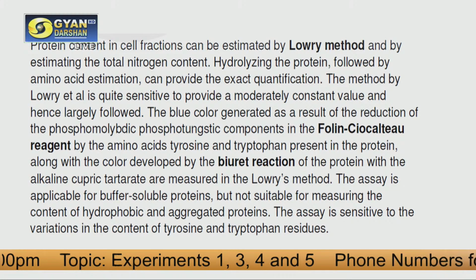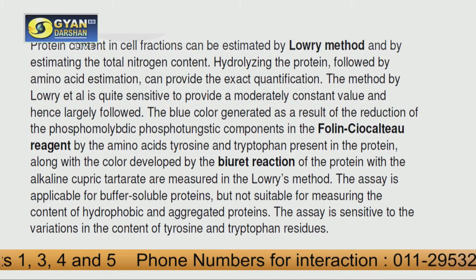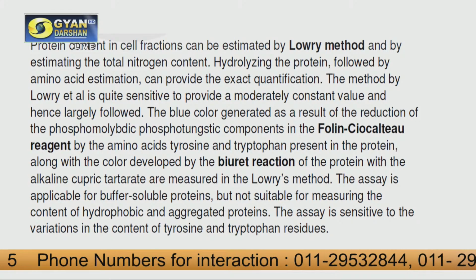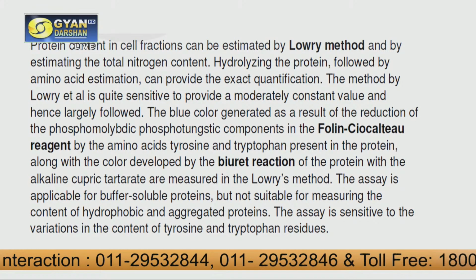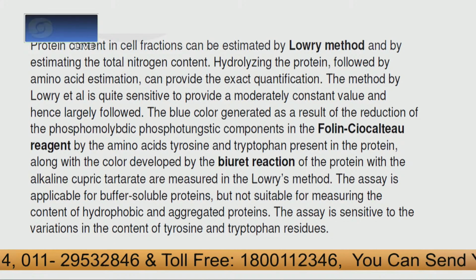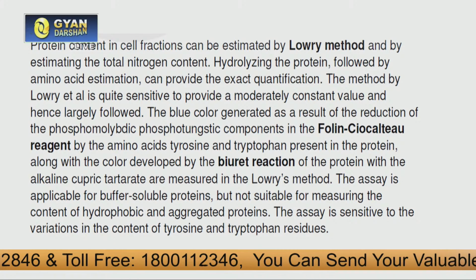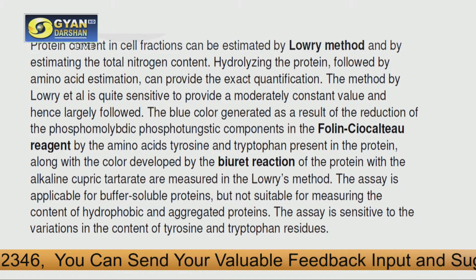Any lab which is working on biochemistry, protein chemistry, or molecular biology should know how to estimate protein through the Lowry method.